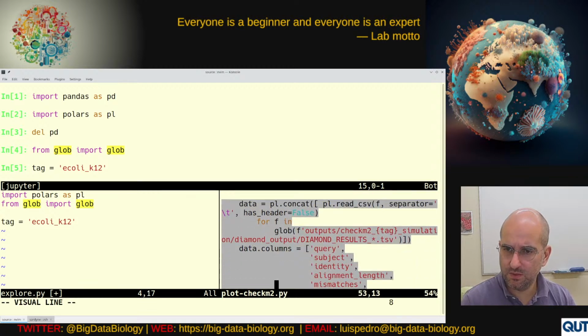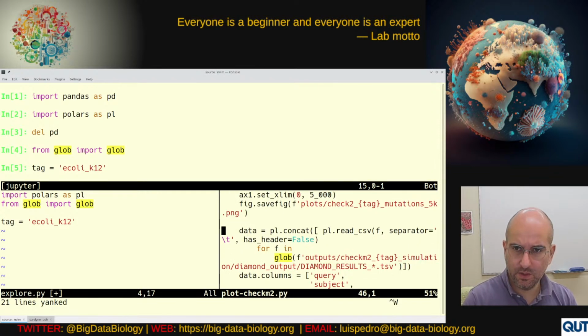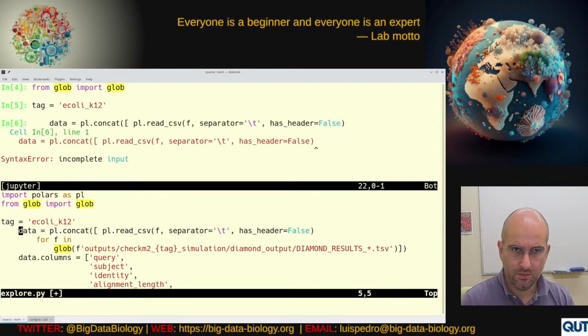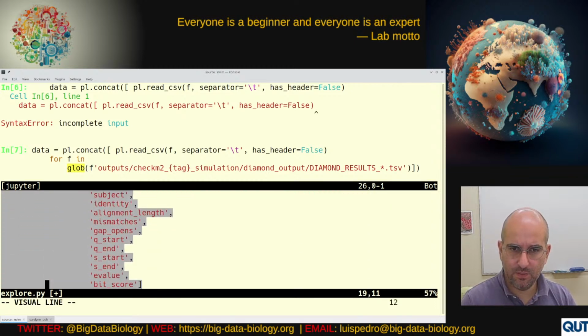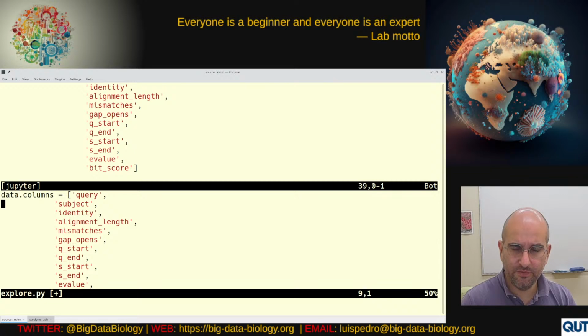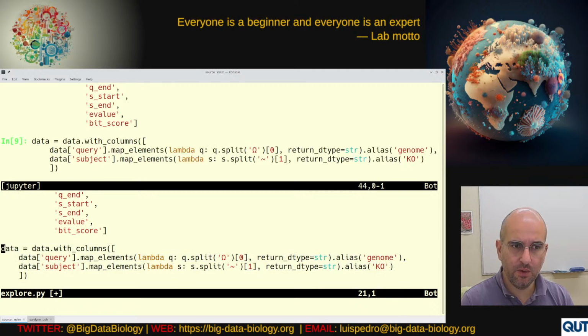Let's just do this same. Okay, I'm gonna do this. Gonna copy over. Okay, so this is the code we had. We just get all of diamond outputs. Remember, the diamond outputs basically mean the different files are all the same. They've been split off only because if one file is too large, they get split off, and now we end up with this data.